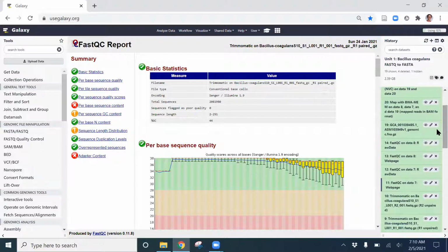Before you upload the reference genome, I would play with the Trimmomatic settings, as well as the step in the project that's due on February 17th to not just trim the data, but actually filter reads. So when you trim the data, you remove bases from reads. When you filter reads, you remove whole reads. So you remove whole sets of 4 lines from the FASTQ file. Once you have that finalized data set where it's trimmed with the best possible settings and you filtered the reads out, then you're ready to upload the reference genome and start the alignment process.